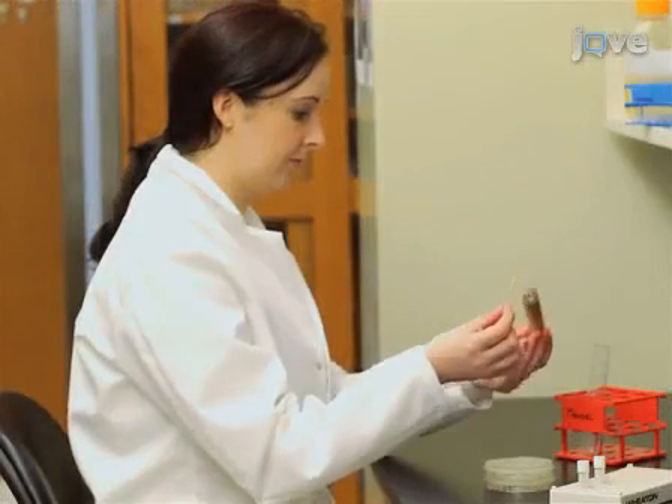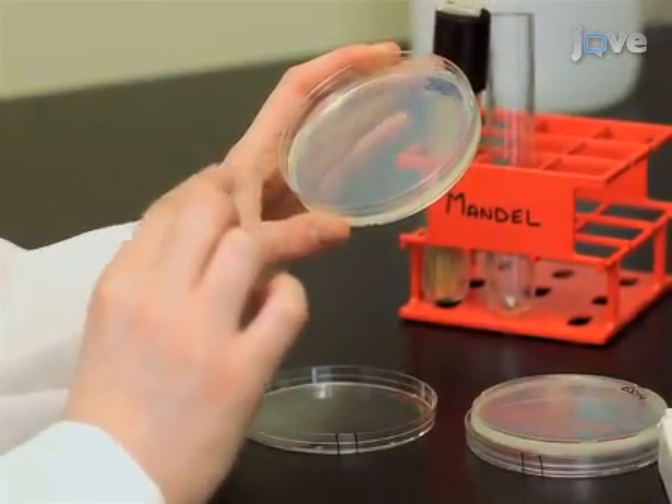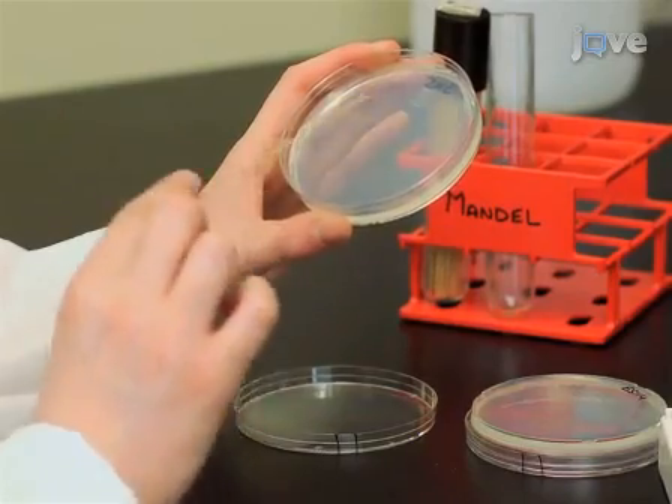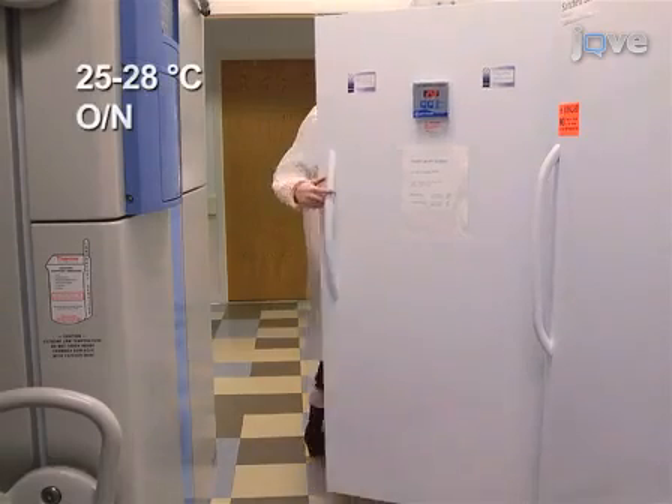To prepare bacterial inocula, two days prior to squid inoculation, plate the relevant bacterial strains on LBS agar. Incubate the bacteria at 25 to 28 degrees Celsius overnight.